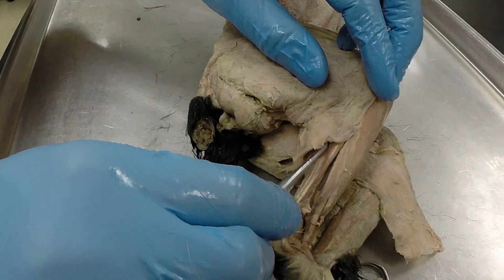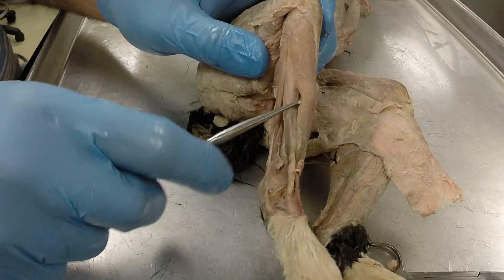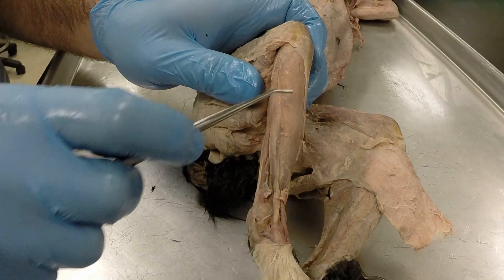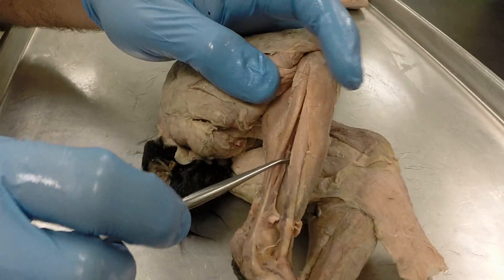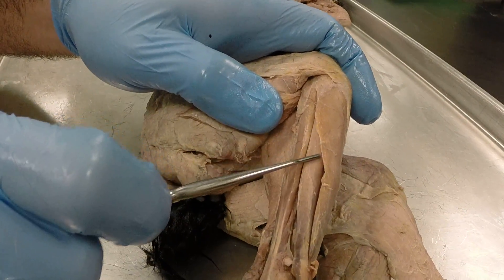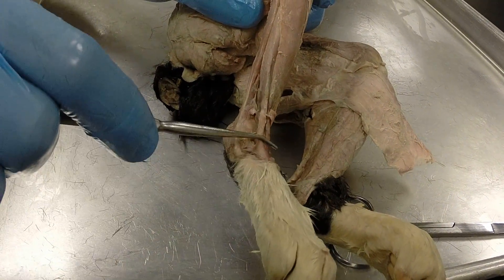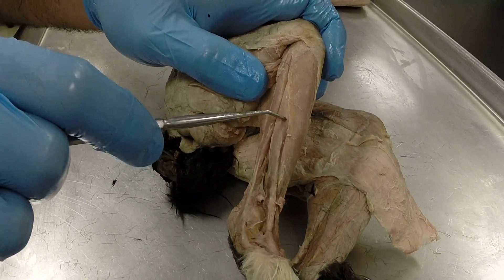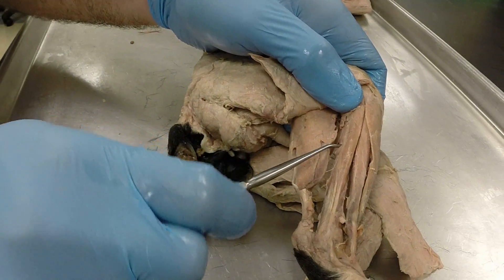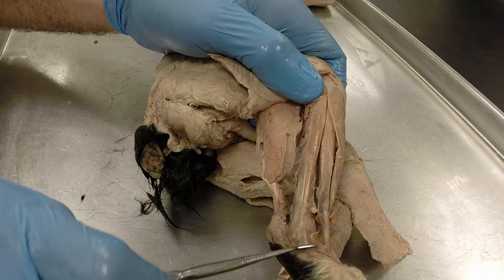Moving to the lower portion of the hind leg, we have the tibialis anterior on the anterior surface of the tibia. Next is the extensor digitorum longus, which you can follow down to the anterior surface of the foot. When identifying these muscles, make sure you follow them to where they're going. The fibularis muscle travels along the lateral side of the ankle.